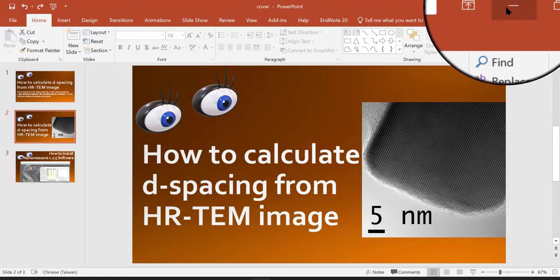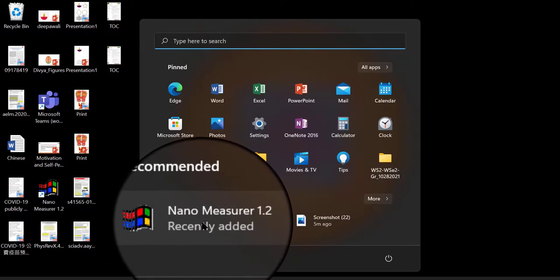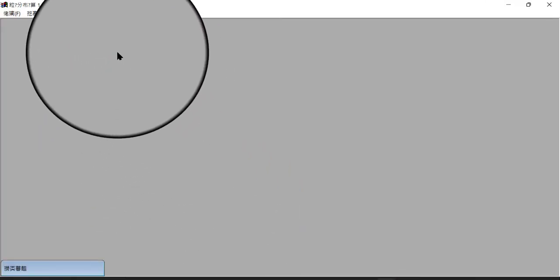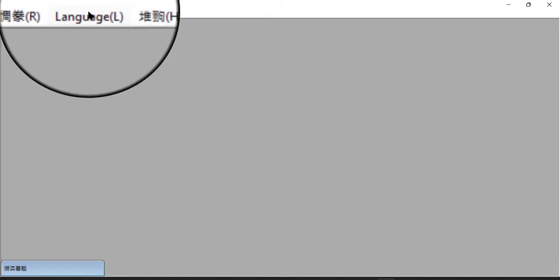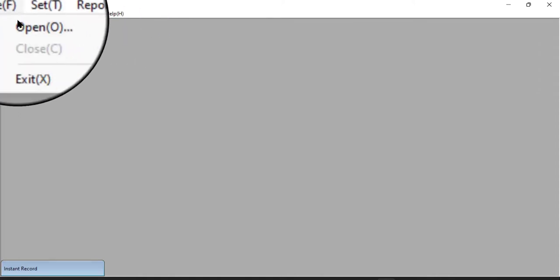So first, open the nanomeasure software. If you want to download this software, please check my previous video. So now change language to English, then open the file.